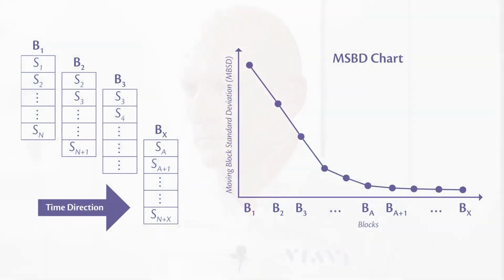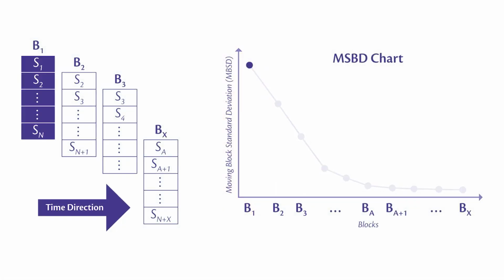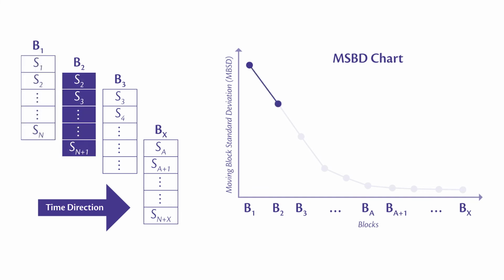A very simple algorithm that allows us to monitor in the proper way the spectral variation is the so-called moving block standard deviation. As you can see from the plot, for each rotation we calculate the area. A standard deviation is calculated on a block of 5 or 10 spectra.